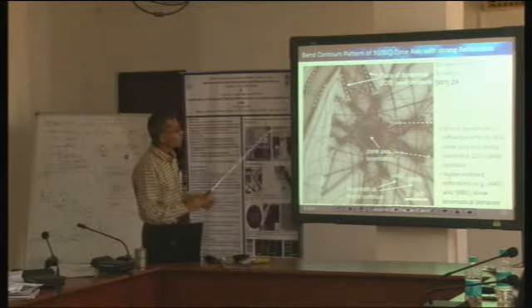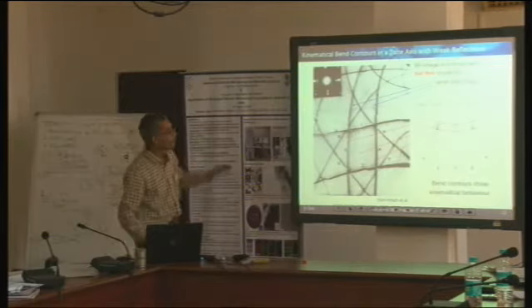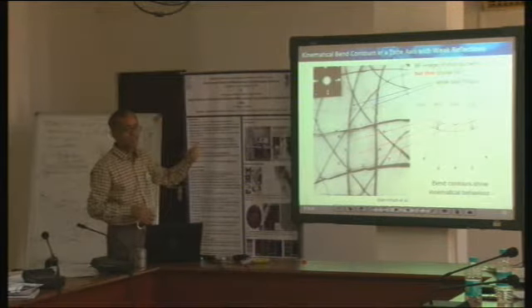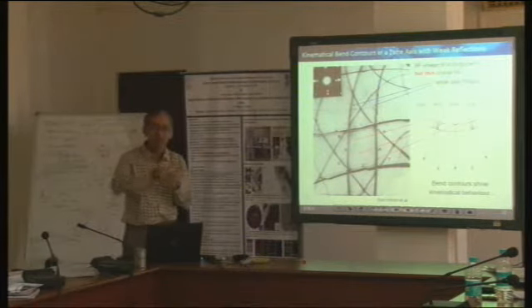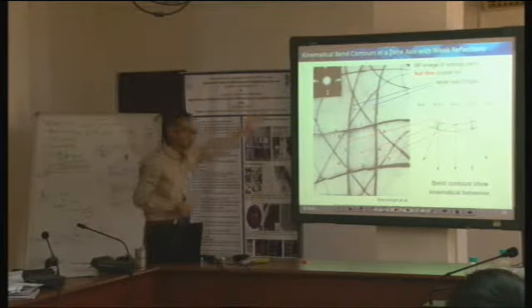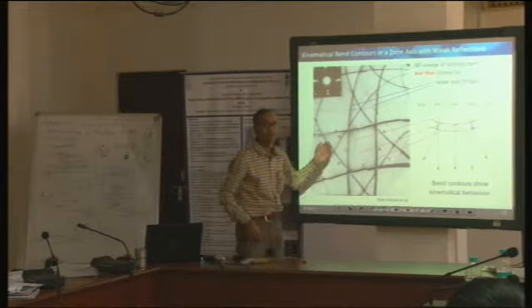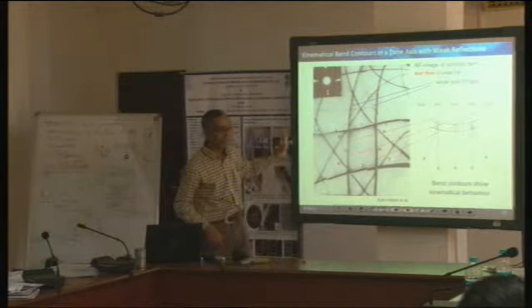That was the thin area of the sample. This is the thick area of the sample. The aim of showing this is, apart from the fact that the dark field image looked as if you didn't know where the sample existed even physically, that when you make a bright field image, it looks like this. In the thin region it is like this, and you can say these are the bend contours, and you may even interpret it like that.